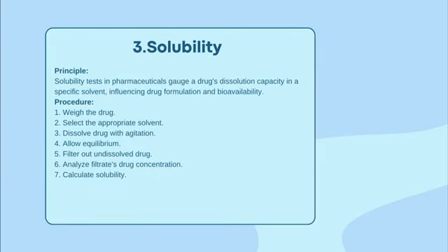3. Solubility. Principle: solubility tests in pharmaceuticals gauge a drug's dissolution capacity in a specific solvent, influencing drug formulation and bioavailability.